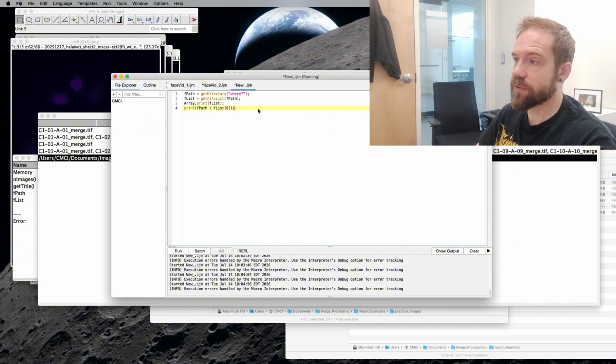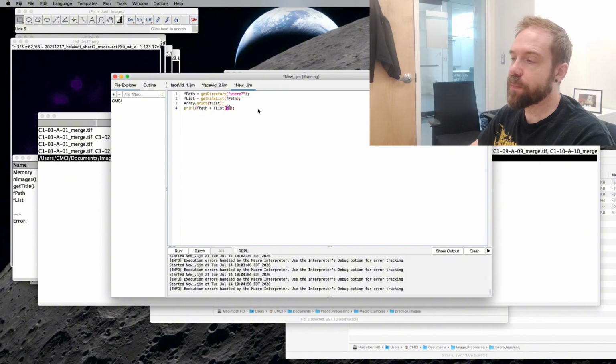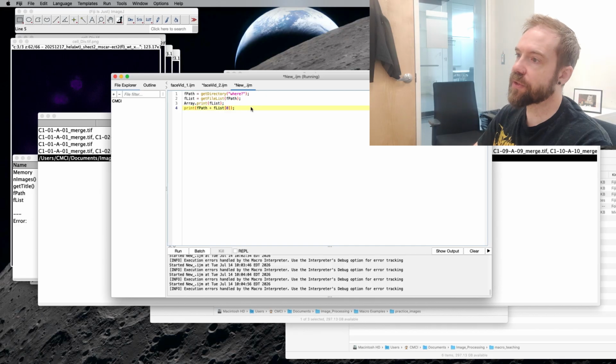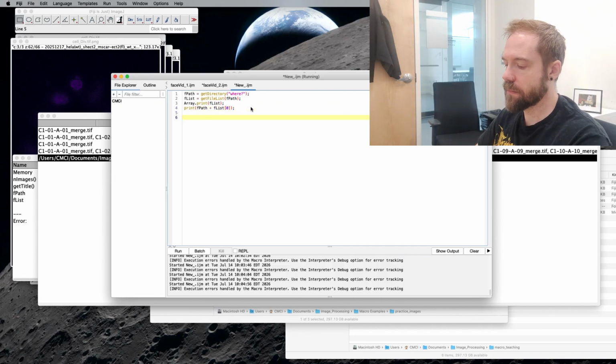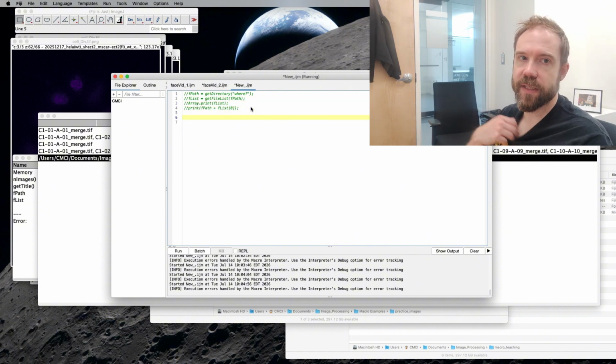It's really straightforward. You just need to identify which of the components of the array that you want to index, and then it will find that element of the array. You put it in square brackets, and that's it. We might also want to index strings. Strings are kind of like character arrays. They're not technically arrays, but they behave in similar ways.